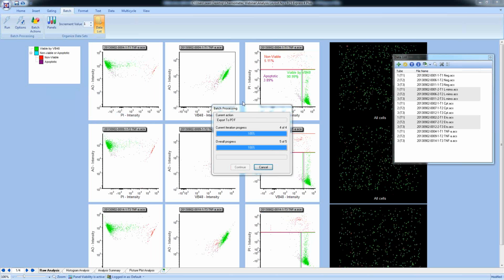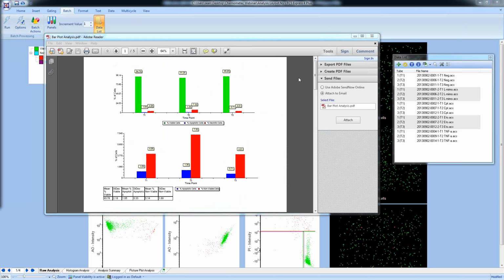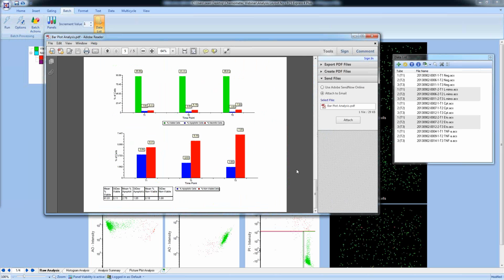And what you can't see on my other screen that I'm going to bring over is that PowerPoint has actually opened up, as well as PDFs and Excel. So I'm going to bring all of that over as soon as it's done loading. And what this means is that we now have a PDF document. This has all of our bar plots. See 5 different samples, so we can quickly and easily scroll through to look at the changes between these samples.